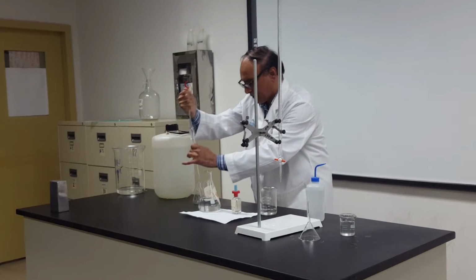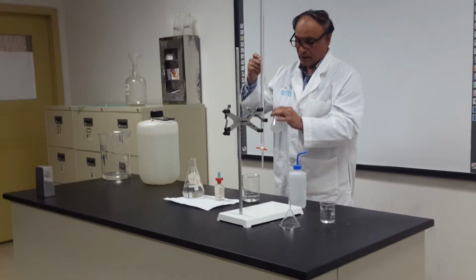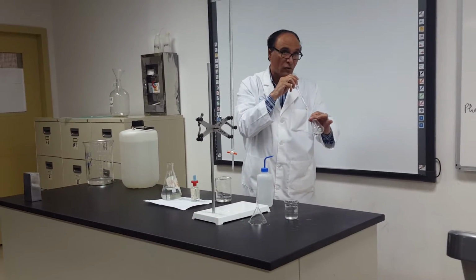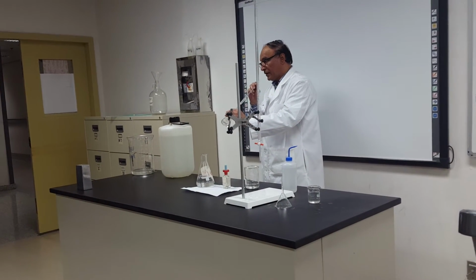And transfer it. It's not easy. When you will do it, you need an experience. And don't blow. Never blow it. That is the wrong technique. And listen carefully. Do the way I am doing.